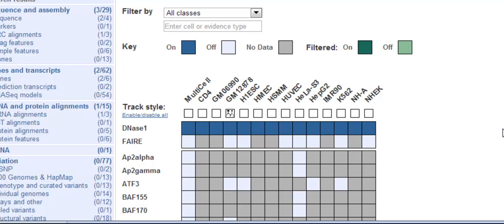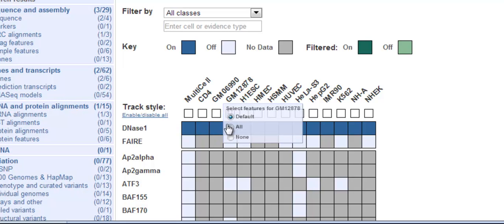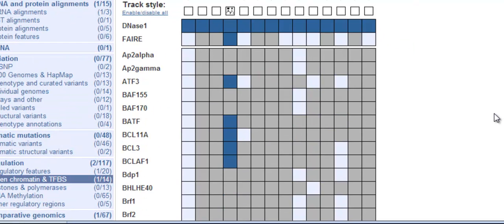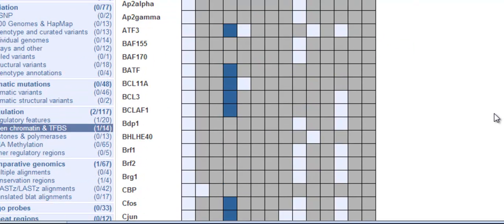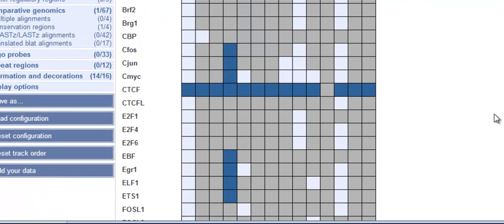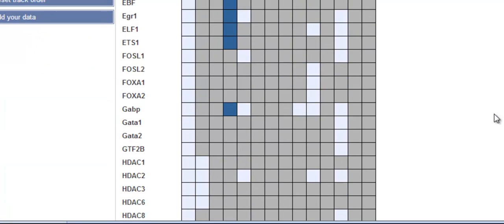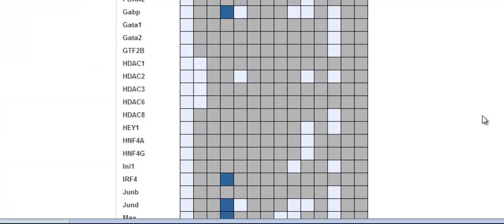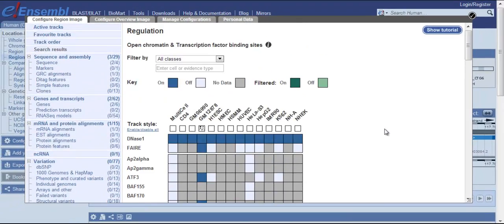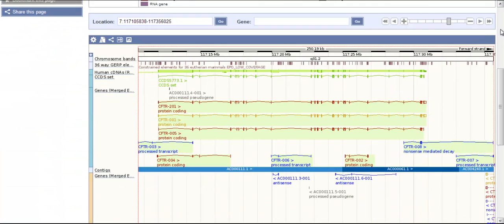To turn on all possible data for GM12878, I hover over the label and select all. Now all the data boxes available have turned blue and are switched on. Let's close the menu and see what we get.